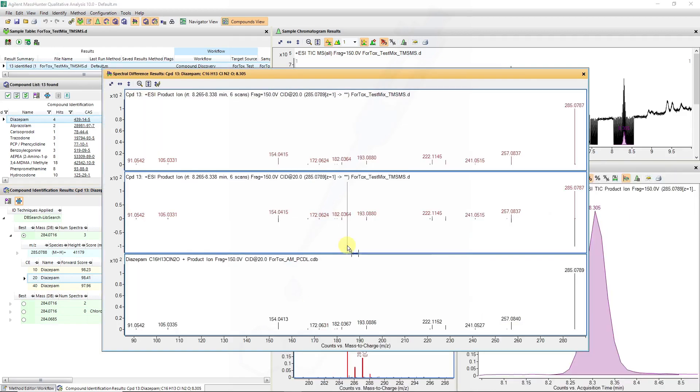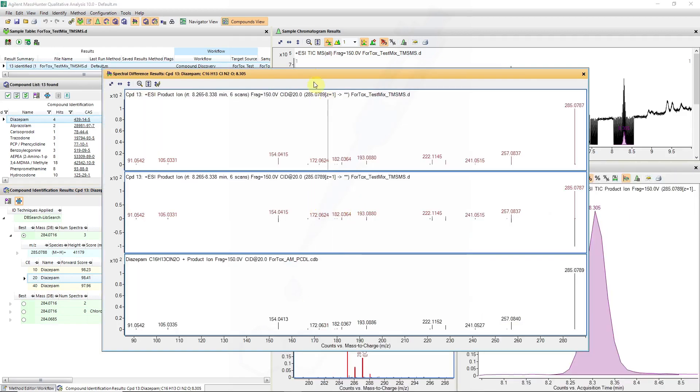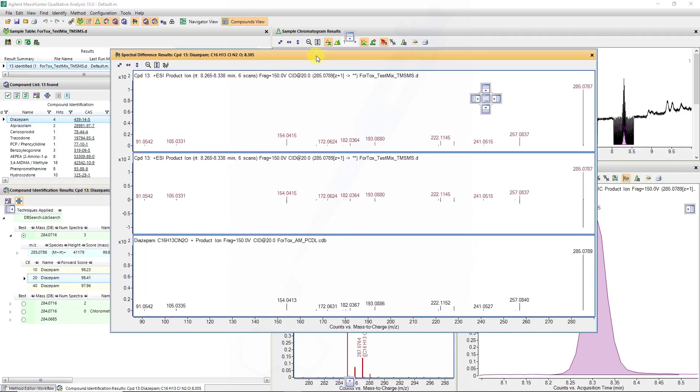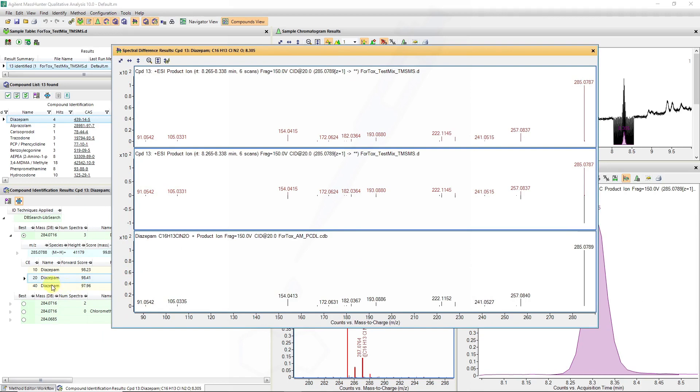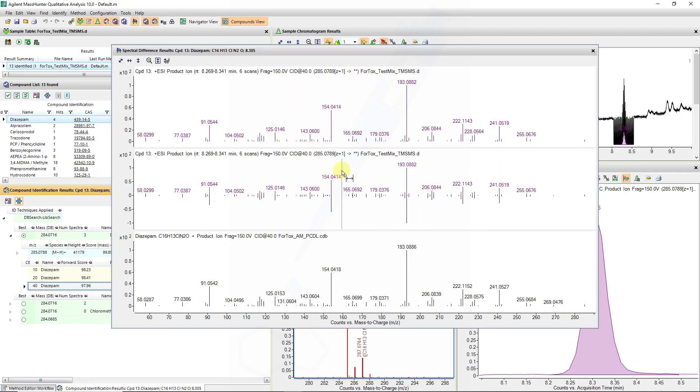So if we look at the difference results just by double clicking we can then zoom in, and if you look at the high energy 40 electron volt spectra we can see we have fragment ions for diazepam and these correlate well with the intensities of the library entry.